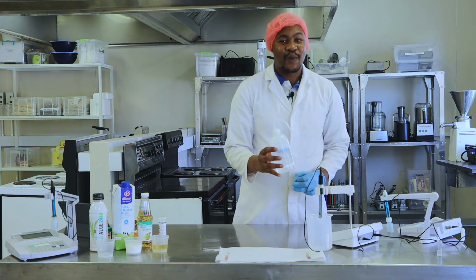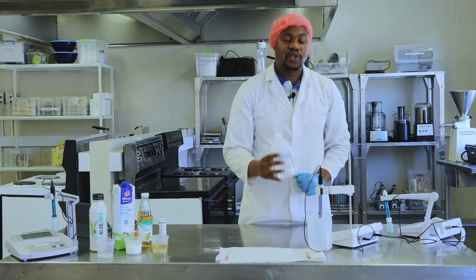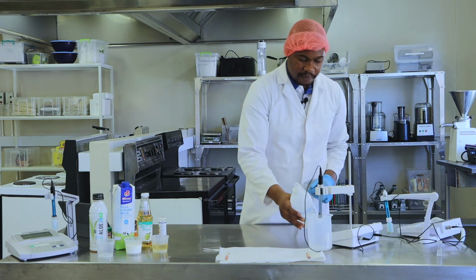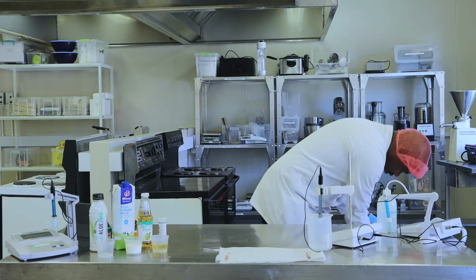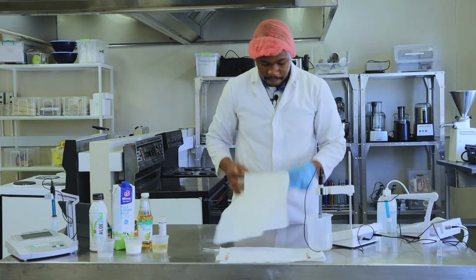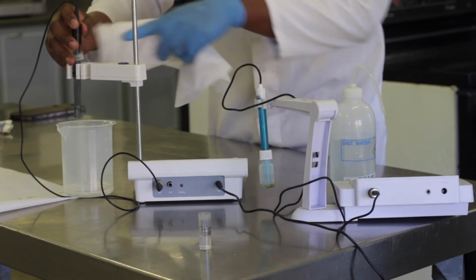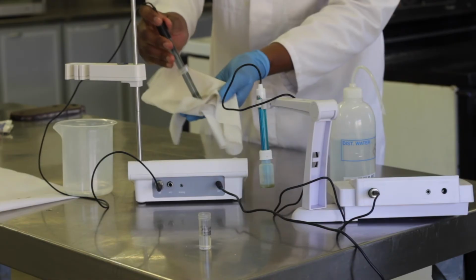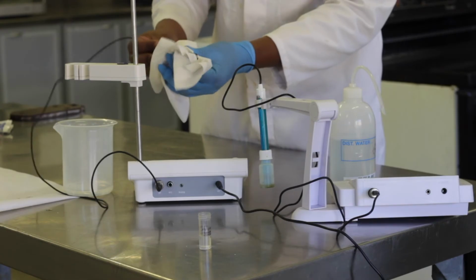So you must tell us, what is the pH of distilled water? I put the question to you. Find out why we use distilled water and what is the pH of distilled water. Right? And this is what I'm going to do. I can take out my probe here and then just slowly blot it so that the distilled water does not remain.